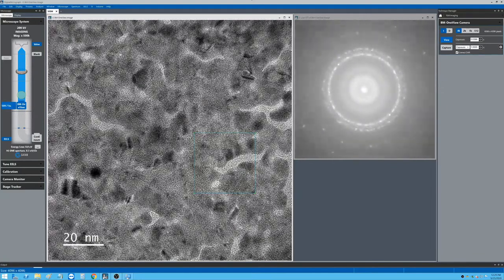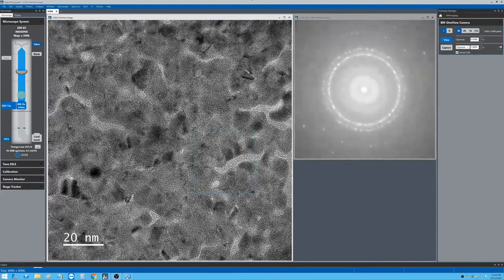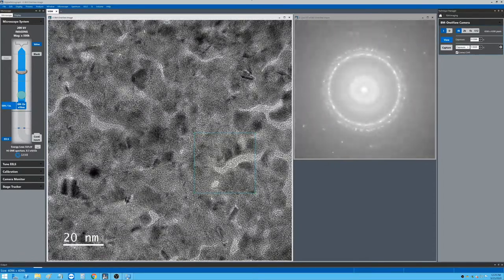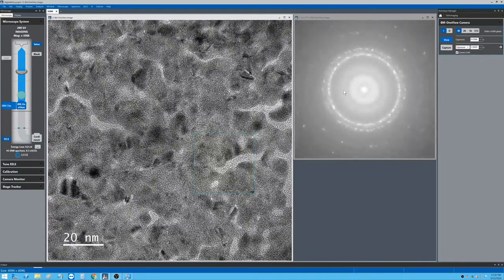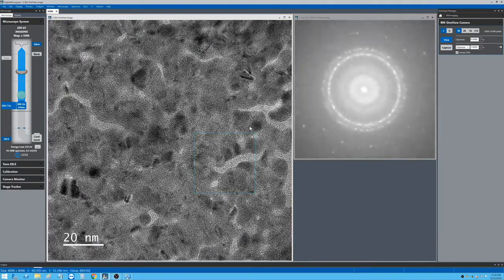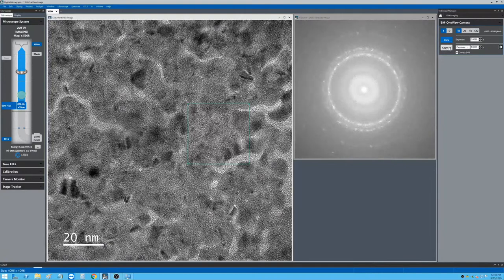The reason I want to do about 60 nanometers is that we want to get close to the Scherzer focus. On our tool, the Scherzer focus is about 50 to 60 nanometers. It depends on the actual spherical aberration value, but I can tell you that it's about 50 to 60 nanometers. So from that in-focus point, you go about 50 to 60 nanometers under focus, and you should be able to get the best image like here. So now you can set the exposure time for the capture and just click the capture button.